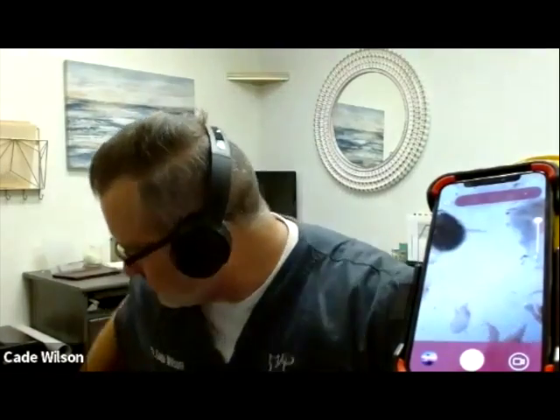One thing, I went to multiple colleges this last year, and I got to see a lot of different ways to skin the same cat. A lot of smart boards still have a hardwired attachment. Some of them are HDMI, some of them are VGA cables. So I was going in with these little lightning adapters so I could connect right into my smartphone and then into the smart board of the classroom, and it could be on the big screen in the room. That's another idea. If you have the ability to take a microscope into the main room, it can literally be sitting on the desk, shot up on the wall so everybody can see at the same time. Let's see if I can find a little bit more.